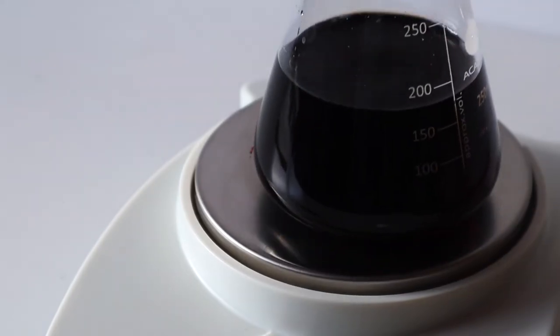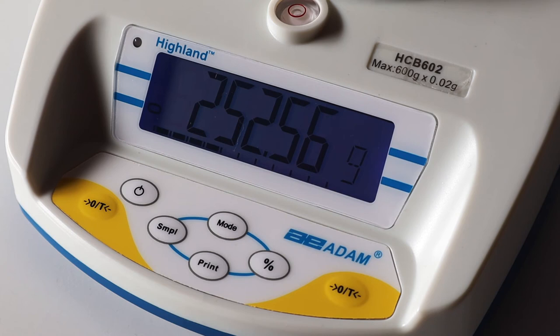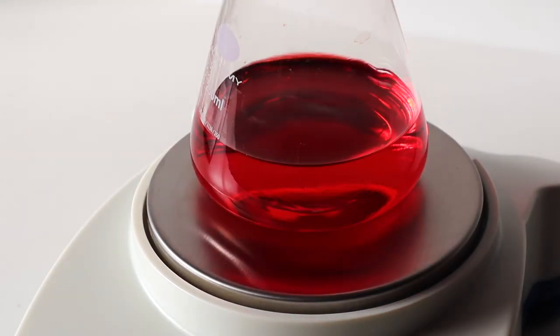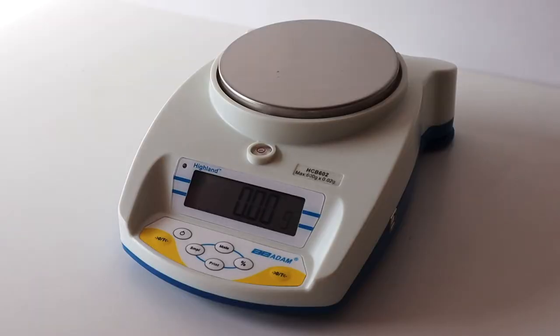You can ensure the items you're weighing are the correct weight with percentage weighing. Use an item as your target weight reference by placing it on the balance. Press the percent button, and the display will show 100%. Then, as you add other items to the balance, the display will show weight as a percentage of your reference item. For example, this item weighs very slightly less.